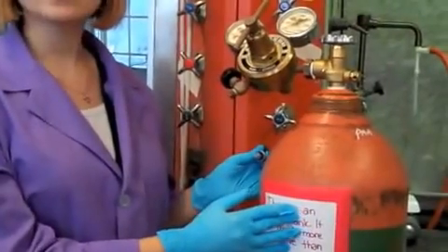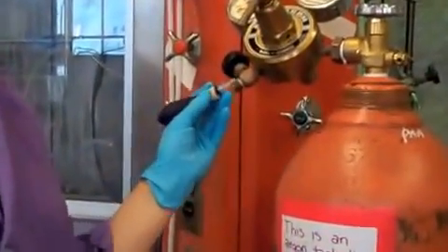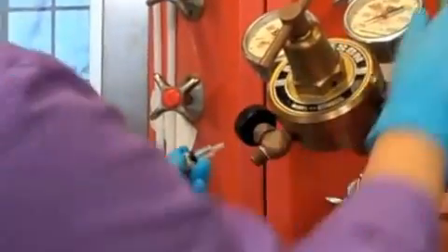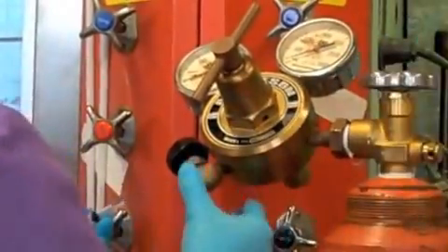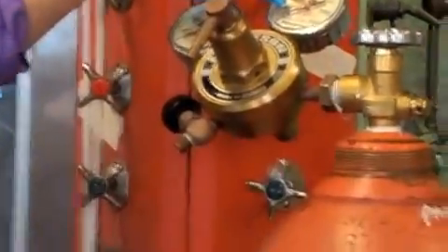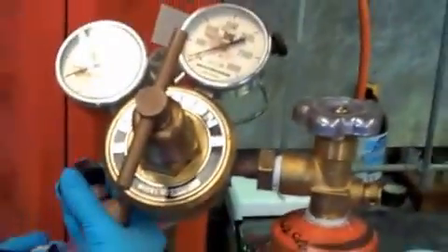Note that we have this second tank in the lab that we can use to purge balloons. As with anything, we always purge 3 times. So I'll make sure my tank is on, and I turned on the large valve, and you can see the pressure go up here. Now I'm going to open this smaller valve to fill the balloon.